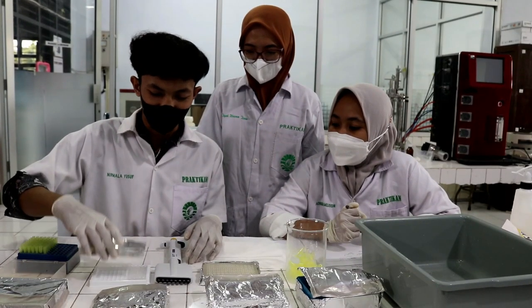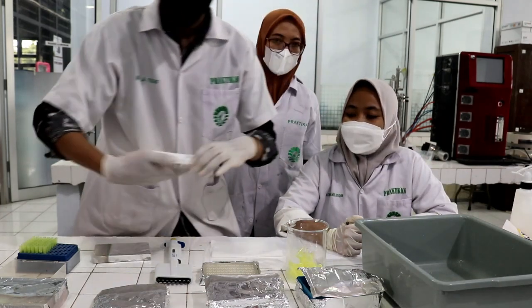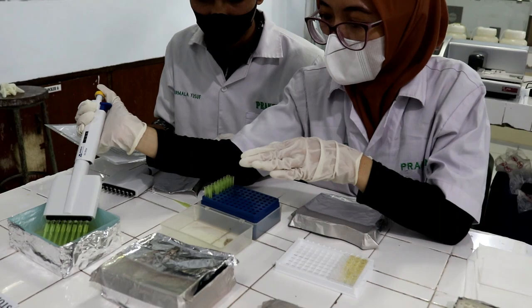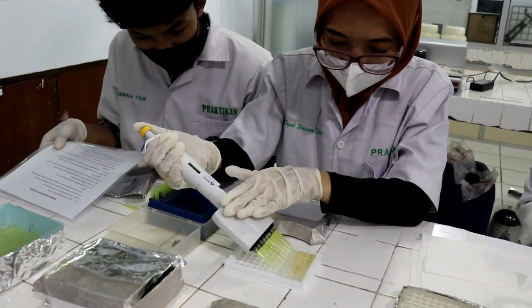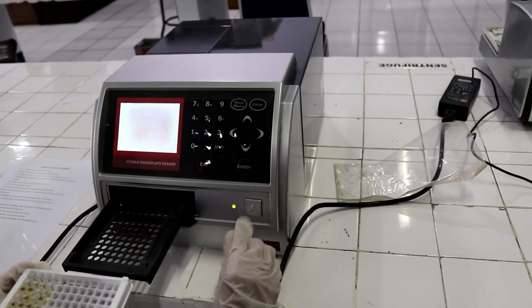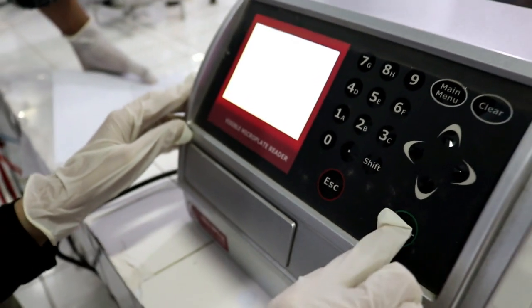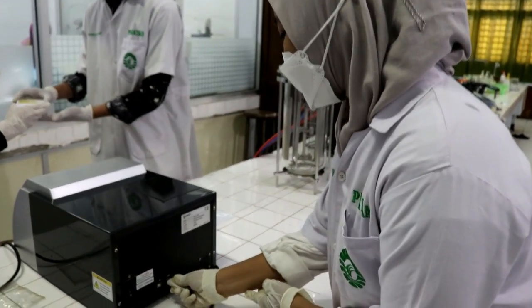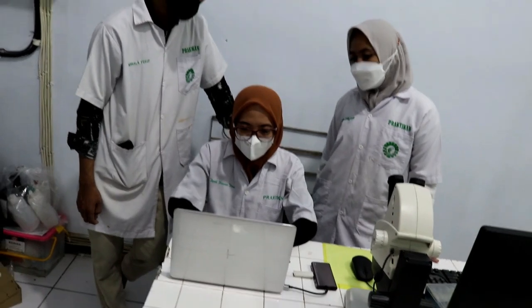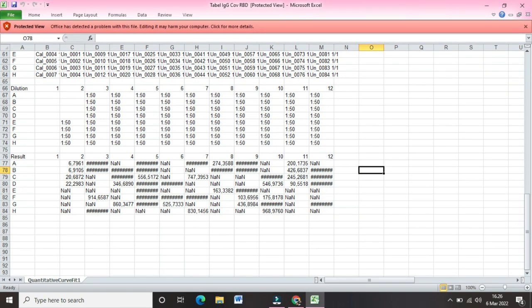Following the incubation period, the ELISA plate wells were washed 3 times with 300 microliters PBS. Then, 100 microliters of secondary antibody was added to the ELISA plate well, which was then incubated for an hour at room temperature before being washed 3 times with 300 microliters of PBS. At the end of this activity, 100 microliters of substrate was added to each well, then incubated for an hour at room temperature before adding 100 microliters of stop solution for 5 to 20 minutes to stop the color formation process. 450 nanometer and 590 nanometer wavelengths were measured with an ELISA reader. The data from the experiment can be copied and viewed on a PC or laptop device using the following table data display.